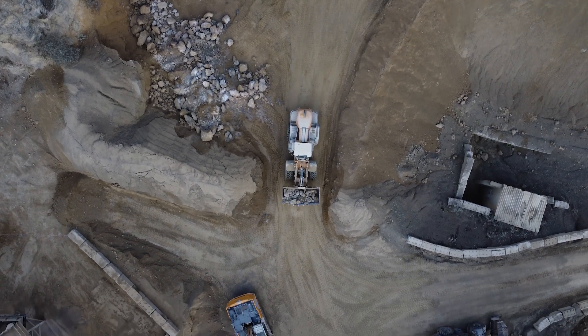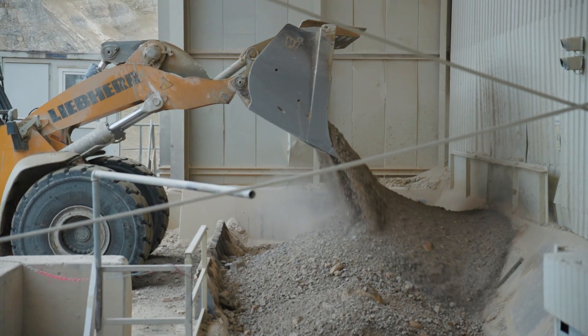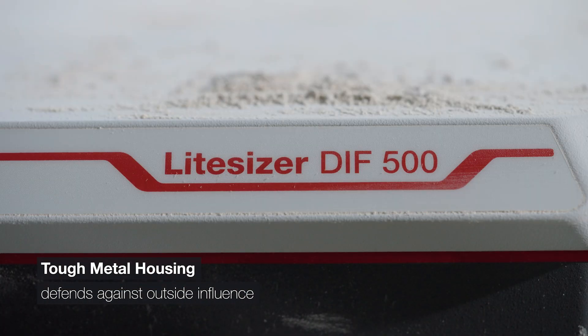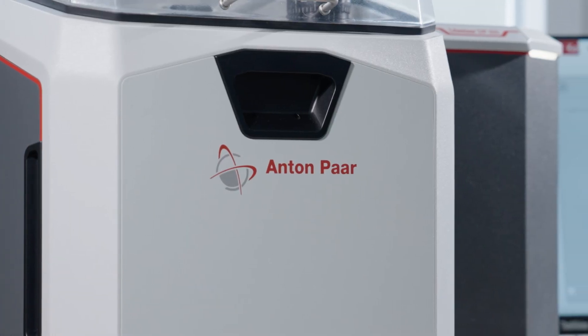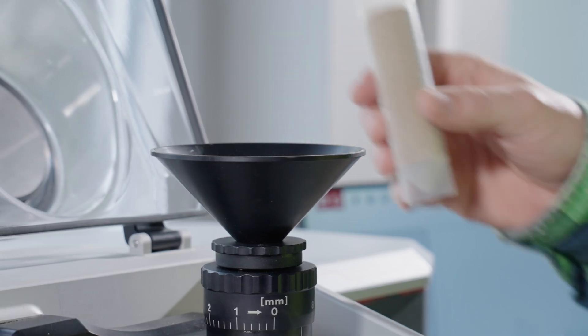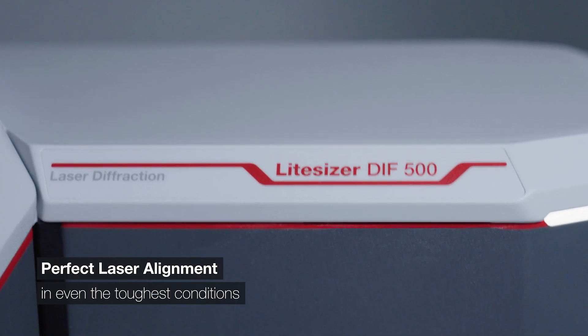Our laser diffraction instruments are renowned for their durability, and this one's no different. Tough metal housing and high-quality sealings protect against outside influences such as dust and water. Shock absorbing elements ensure outside vibrations can't disturb the optics and allow for perfect laser alignment even in the roughest conditions.